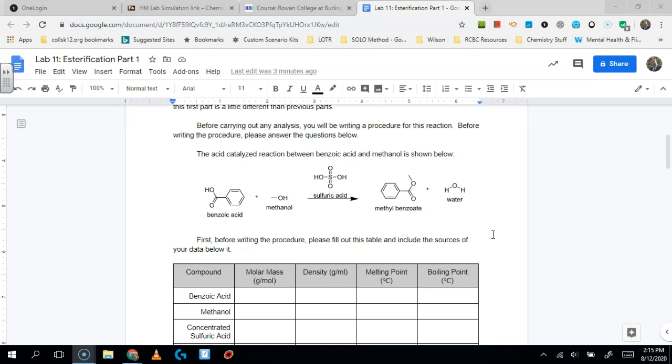You're not going to be able to find a procedure. You have to come up with your own procedure. That said, there's a million different versions of that, which also can be just as daunting. If there were just one accepted procedure for this reaction, then that would also be straightforward. But because this is such a common reaction, there's a million different versions of it. So doing the research to find the one that fits this, or making up one that fits this, is also important.